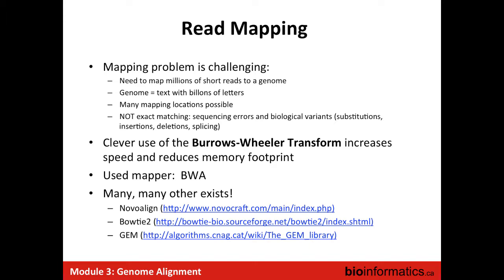And you don't want to look only at perfect matches, because in most of the analyses with DNA-seq, what you want to do is to find variants. So you want to be able to see these variants. If I'm only looking at perfect matches, I will only find the same thing as the reference. So you need to leave some freedom to have some differences be caught.